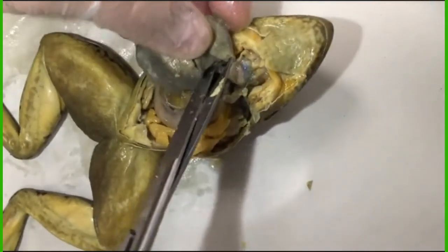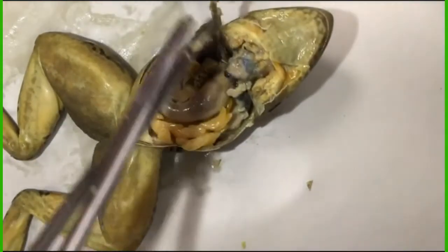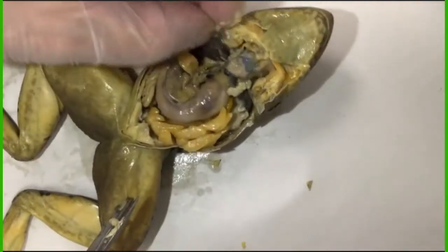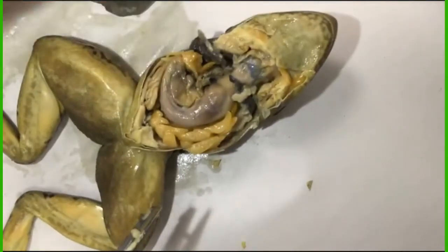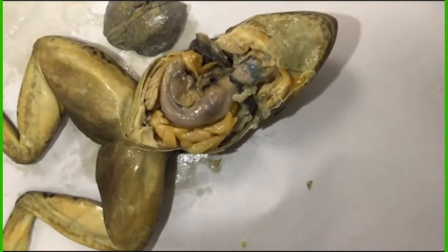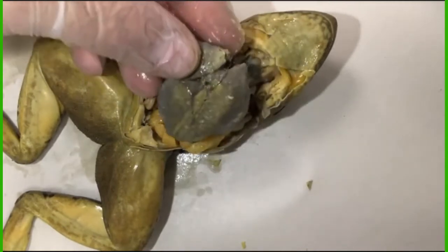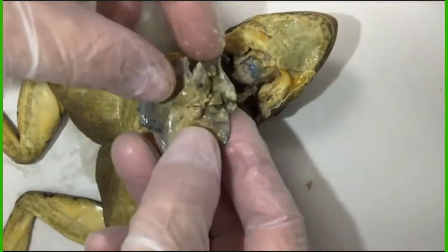Now, right above it is the heart. You see that little dark and white organ. You don't want to snip that, so you've got to be careful as you're going around it, but that's the heart. There's one lung that I'm pulling out there. But now you've exposed some of the other organs, the heart, and right underneath, the stomach. So there's the big three-lobed liver.